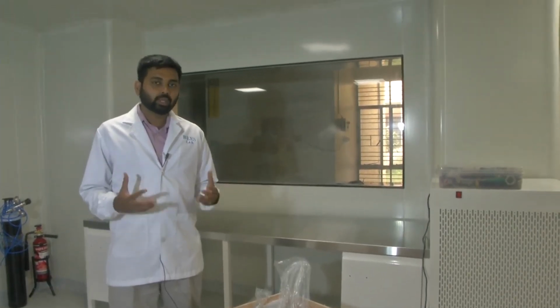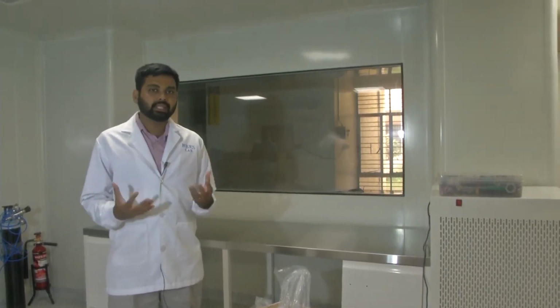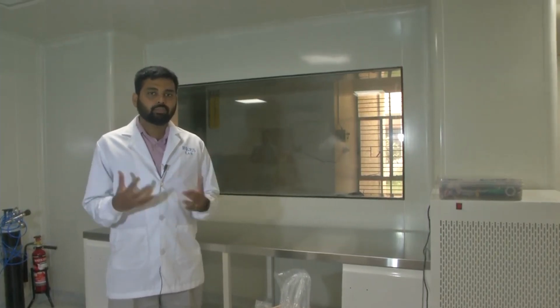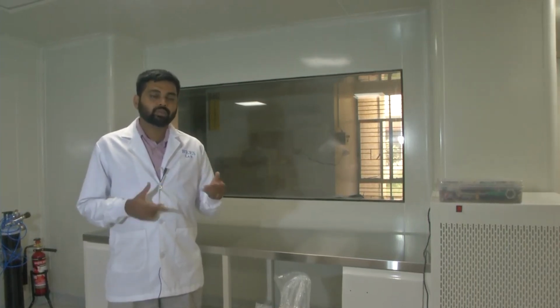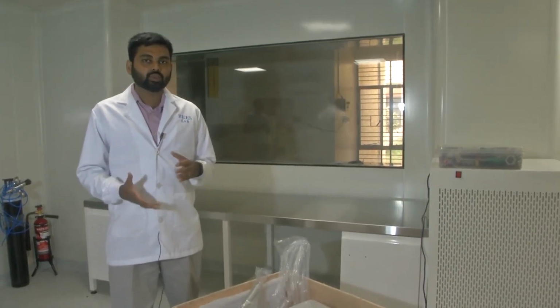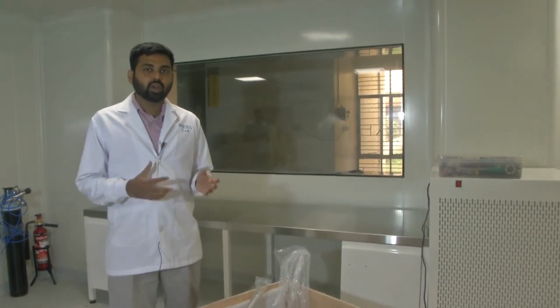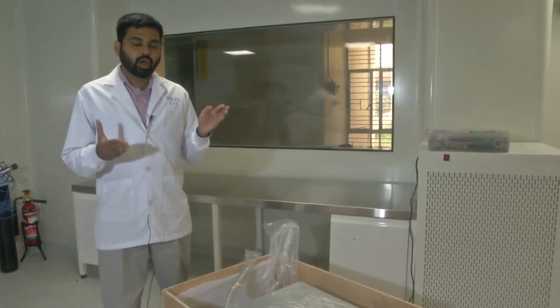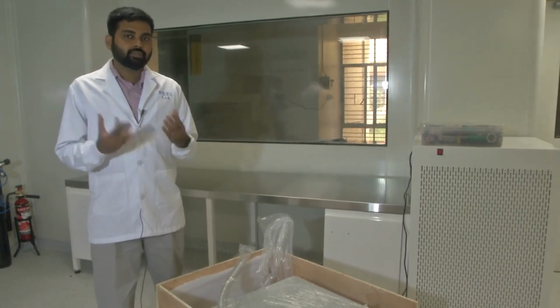So let us say you are making microfluidic devices and you have patterned your electrodes or sensing layer on a glass substrate, and you want to overlay a microfluidic channel on this glass substrate. How do you attach this microfluidic membrane, which is more often made using PDMS, onto this glass substrate? How do you stick those two together? That is usually done in the most efficient way using an oxygen plasma system. It is called plasma bonding. So we keep the layer of PDMS on this glass substrate, and then we keep it inside the plasma system, and the two layers bond.